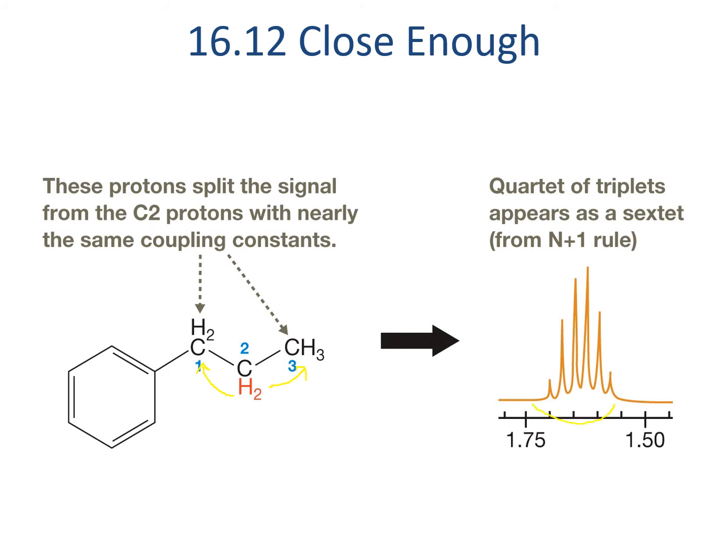Now, we're always looking at real data, and so it's not always the exact same height between the middle peaks, and it sometimes skews a little bit. But when it looks close enough to this ratio, then it probably is.